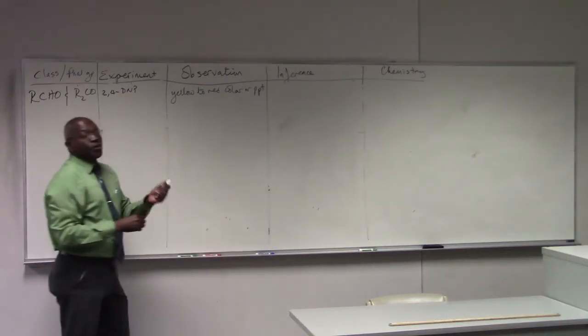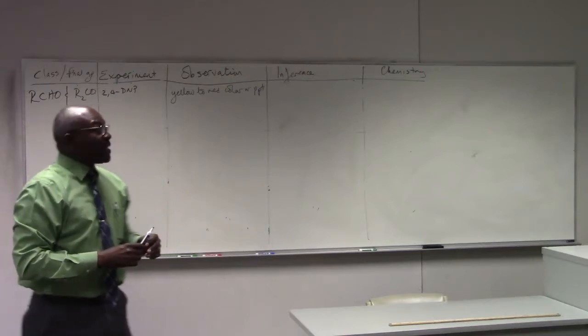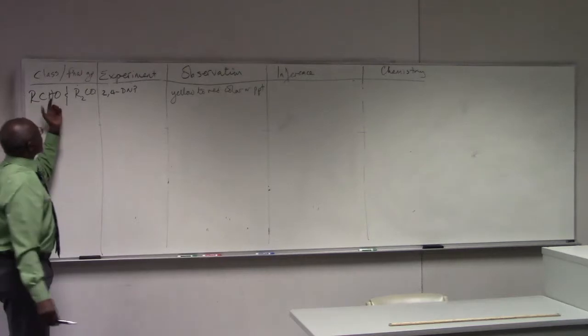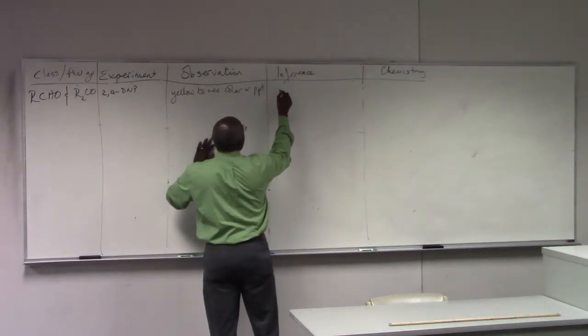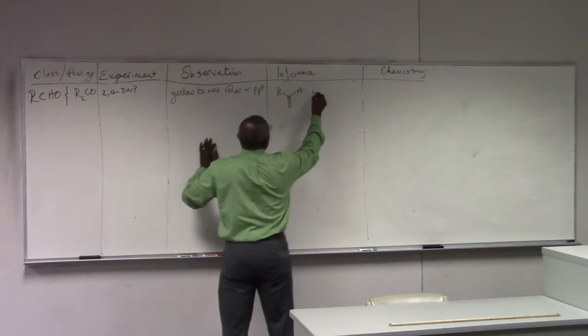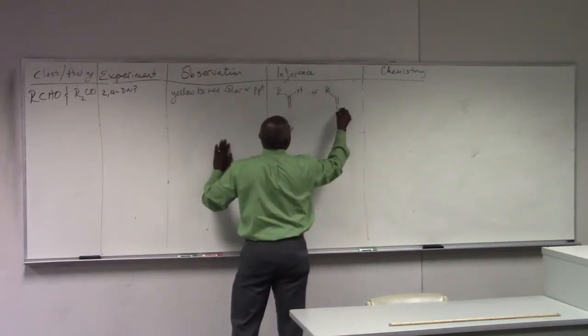That is indicative of the presence of a carbonyl group at the aldehyde level. So this would apply, as I said, to an aldehyde or ketone.